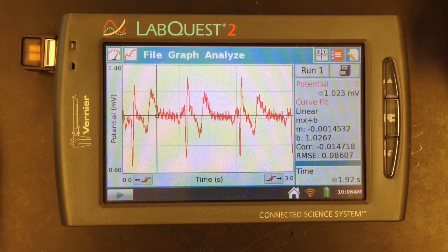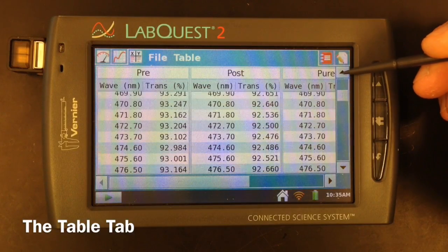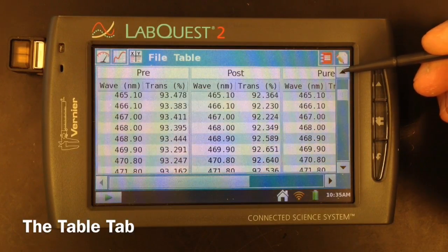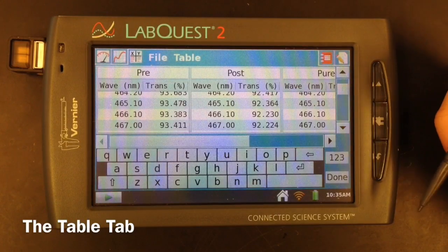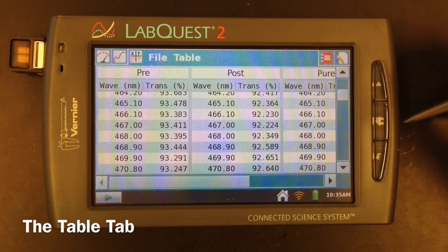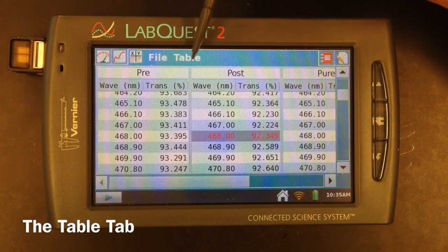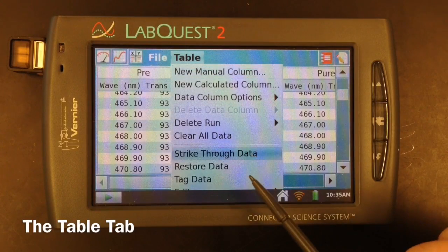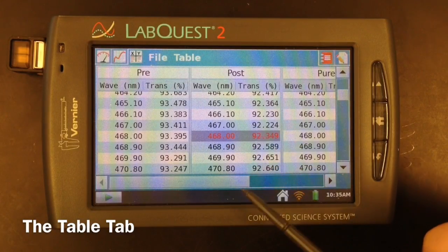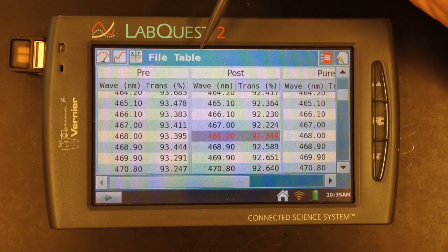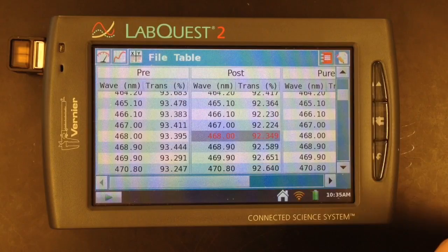Zooming out lets you see the whole graph again. The next tab gives you all of your data in a table form. It shows you each one of your runs and each point of data collected. If you tap on the name, you can change it to something more specific other than just run one or run two. If you had a point in your graph that didn't match the others, you can select it in the table, go to the table menu, and select strike-through data. This leaves it in the table so you have to explain it in your report, but it removes it from the graph, which could give you a better curve fit. You can also restore the data through the same menu.